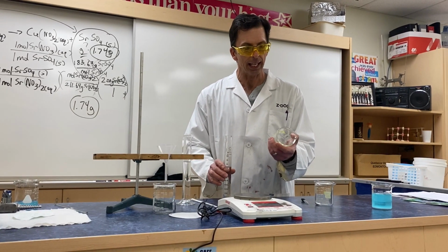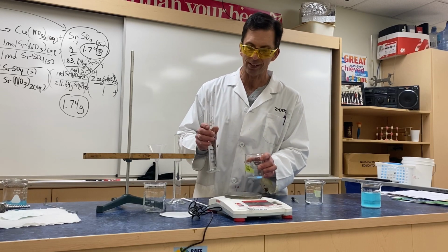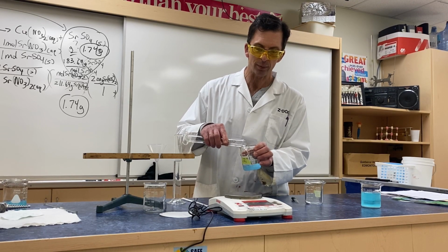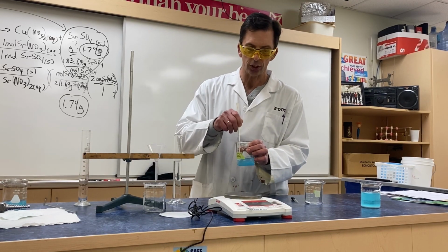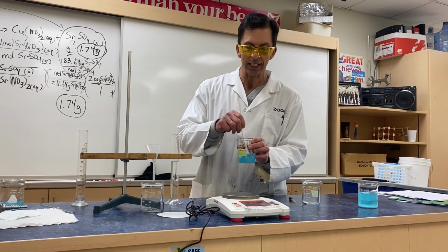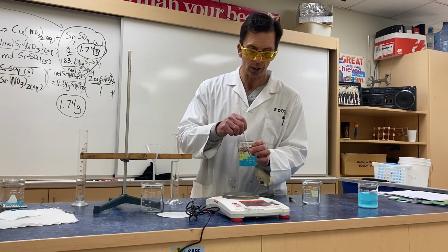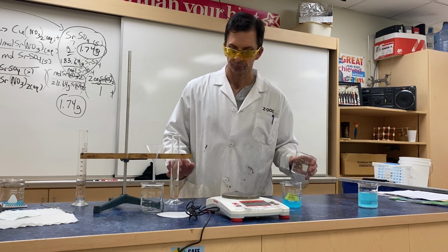What we are reacting is copper(II) sulfate pentahydrate. As Mr. Zed outlined, we need 2.56 grams. This is our excess reagent. We combine that with 75 milliliters of distilled water, stirring it up, getting a solution. In order for ionic compounds to react, they typically have to be in solution. You cannot get much of a product reacting two solids together. Rare occasion it happens, but that's unusual. It's those ions, guys. Remember the total ionic reactions that we were just finishing?